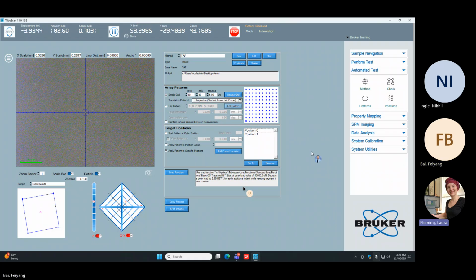Okay, so does this method make sense to you? Yep. Okay. Did you want to talk about position groups? It's basically a more complicated version of this. Under what circumstances are we going to use that? I don't use it very often. I don't know many customers who do. A lot of the functionality in the methods is repeated, but we've made it easier to use over the years, because some people are using really old methods out in the field, so we can't take away certain things, but we can add certain things.